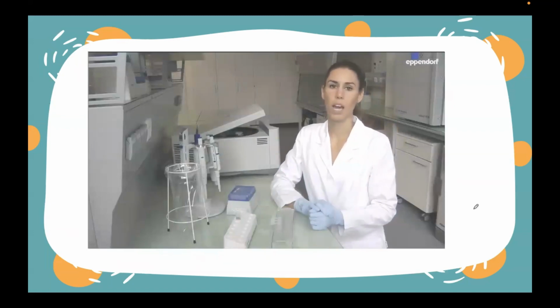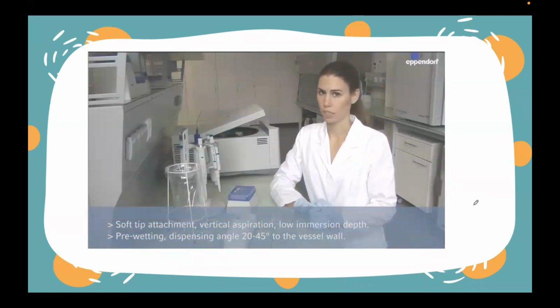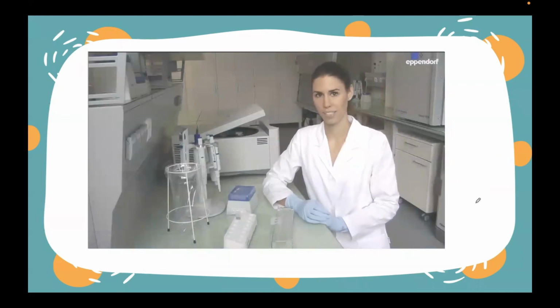Achieve accurate and reliable pipetting results with soft tip attachment, vertical aspiration, a low immersion depth, and a 20 to 45 degree dispensing angle directly in contact with the vessel wall. So, improve your pipetting skills.